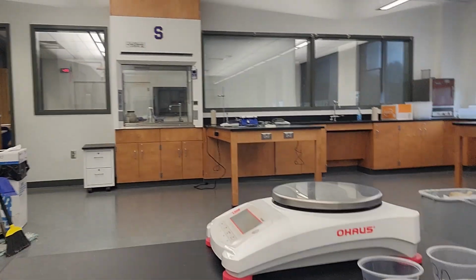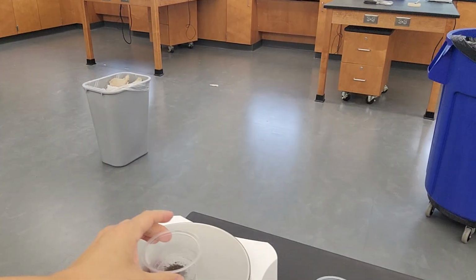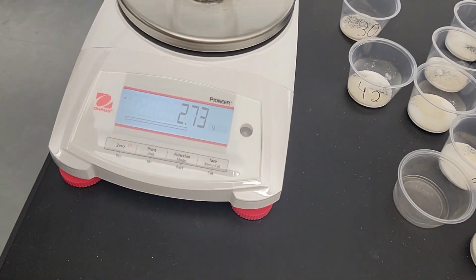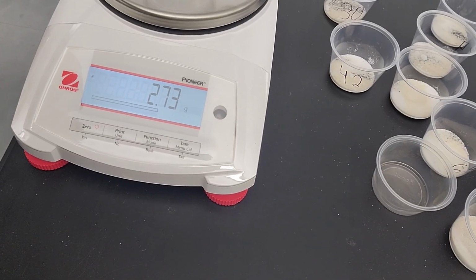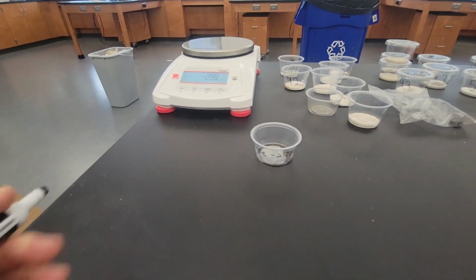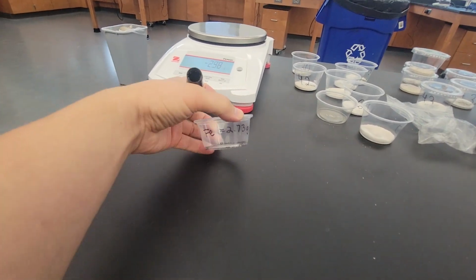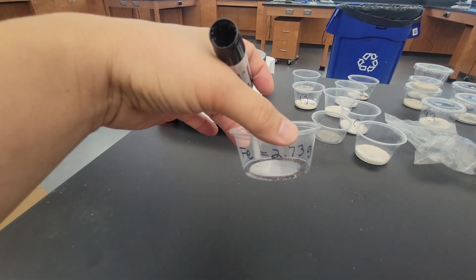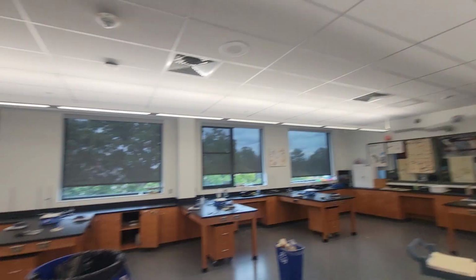I already zeroed my scale earlier. 2.73. Had to switch the camera angle again. So we got 2.73. Wrote that on the cup, and also I'll mark that on my board.